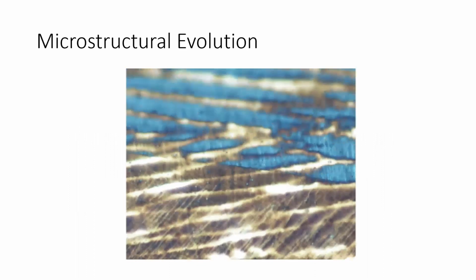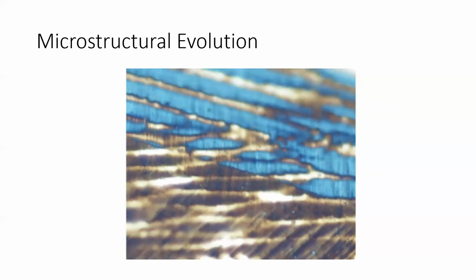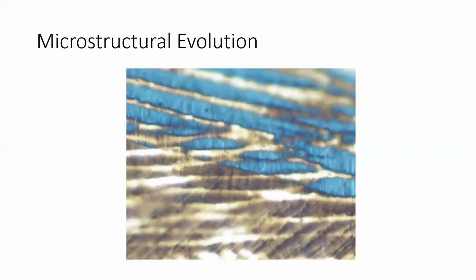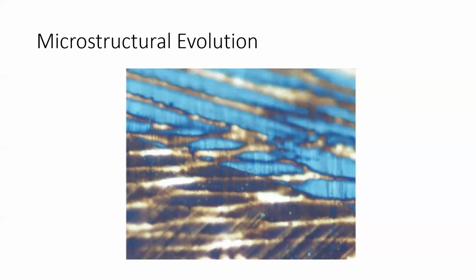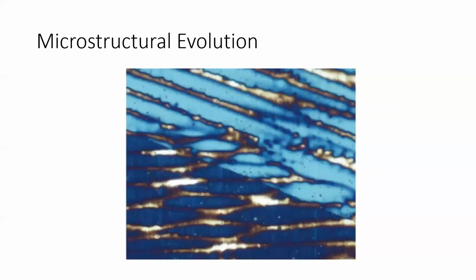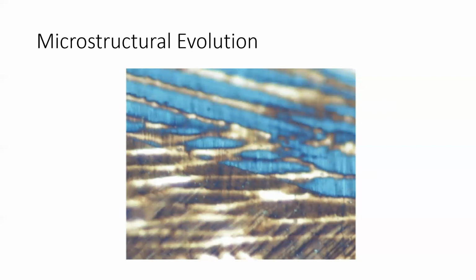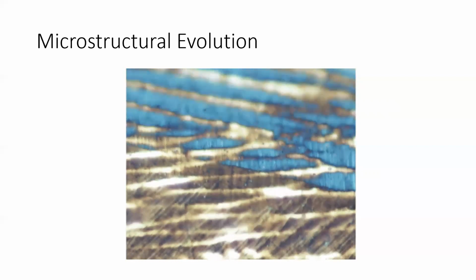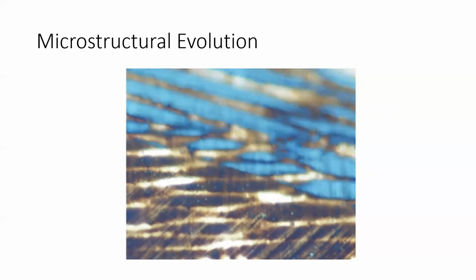The GIF on screen shows a microscopic example of a material sample undergoing deformation due to stress being applied to the sample. By identifying and characterizing the individual microstructures such as grains or cells, they can work to improve the mechanical properties of the material at large. However, this process can be very tedious and resource intensive. As such, it is extremely beneficial to automate these processes.